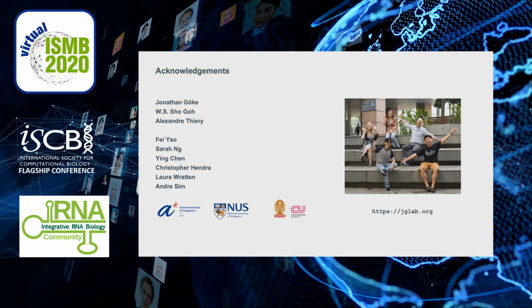Last but not least, I'd like to highlight that the data used in this work is from the SG-NEx project, a resource for not only direct RNA-seq data, but also cDNA and a lot more on cancer cell lines. If you want to hear more about the project and transcript quantification for long-read data, you can virtually visit HiTSeq, where my colleague Yingsheng will give a talk there.